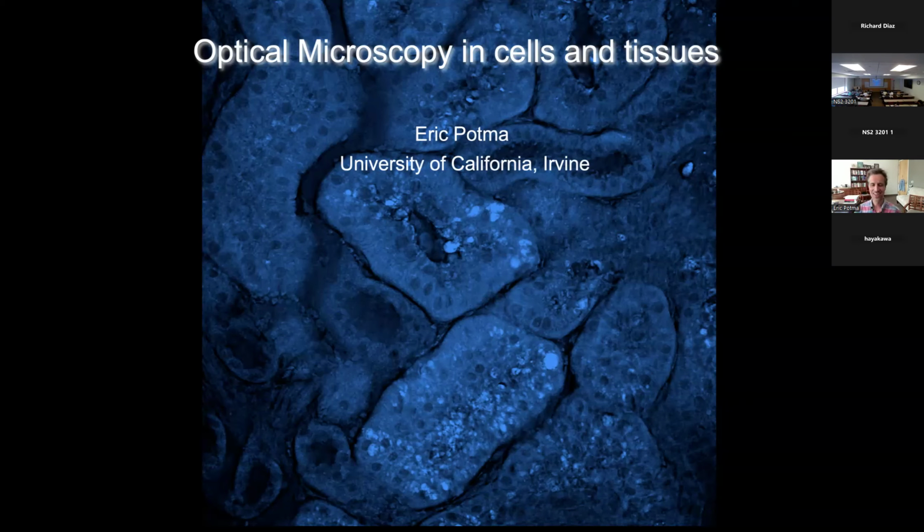All right. Okay, so we're going to talk about optical microscopy in cells and tissues, and my expertise is really in nonlinear optics, nonlinear optical microscopy. So we will definitely focus on that mostly. But I just want to start from very simple principles, humble beginnings, and then we'll touch on some additional, more advanced topics.